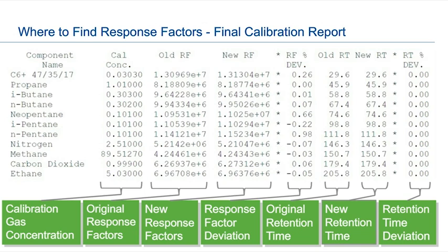Say if you're in flare applications, there are EPA rules that tell you how often you have to calibrate. So the GC will not randomly pick a calibration time for you. You need to tell the GC. In most cases, for most applications, you can set the calibration time per your requirements. It is those requirements that you have to know yourself. They change by application, by specification, by regulation, and by your own company's procedures. So there is no set answer that we, as a GC manufacturer, will tell you. I can tell you, though, that within the GC you can set up the calibration cycle per your requirements to do it automatically.